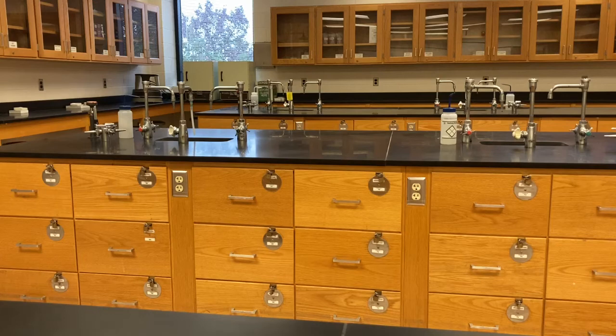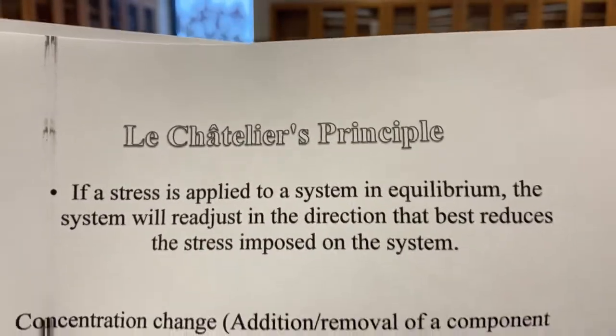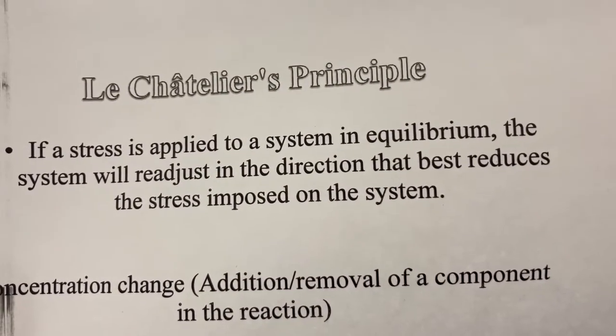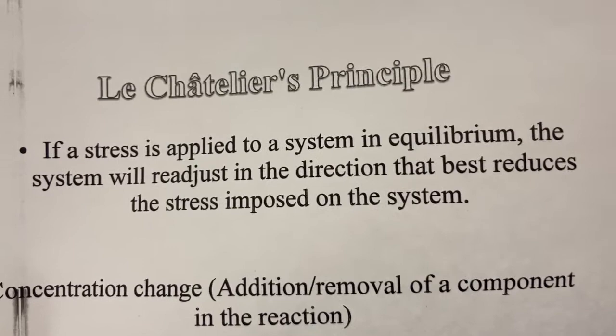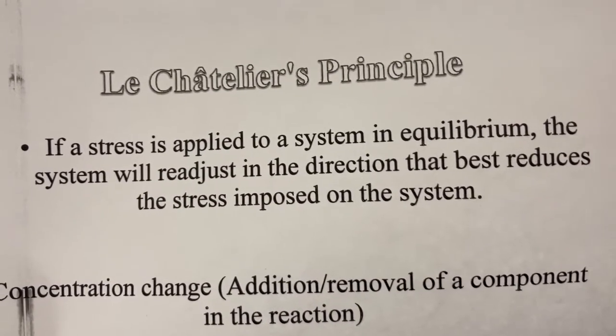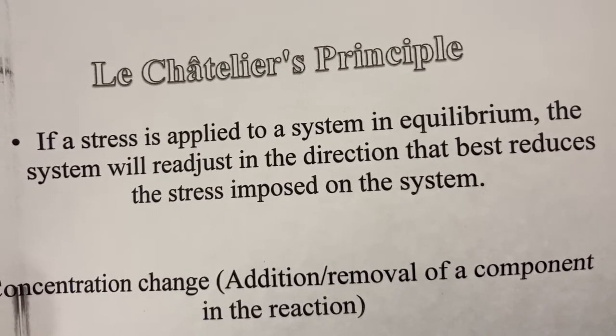This is experiment 15, chemical equilibrium and Le Chatelier's principle. Le Chatelier's principle states that if a stress is applied to an equilibrated system, the system will adjust itself to reduce the impact of the stress to the system.